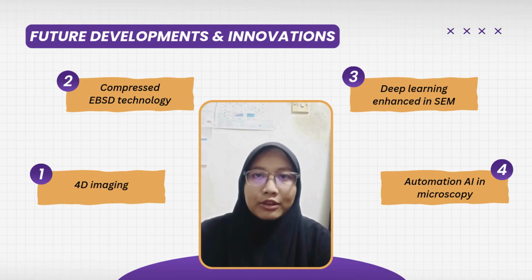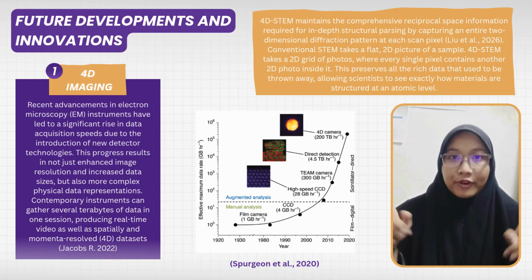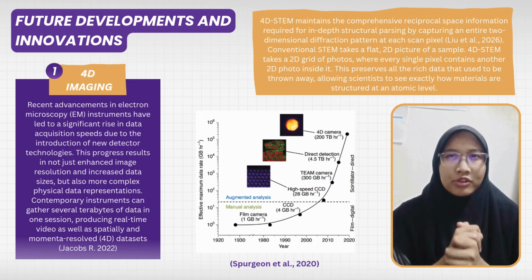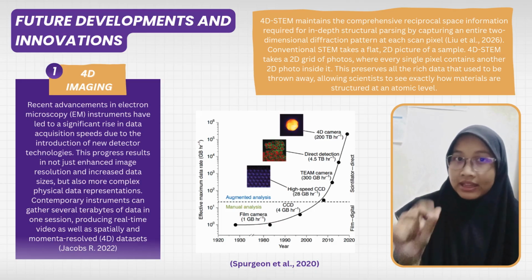Now, we will look into future developments and innovation in electron microscopy. Now, we will look into 4D imaging. Traditional electron microscopy captures flat, static snapshots, which is a single surface or thin slice frozen in time.